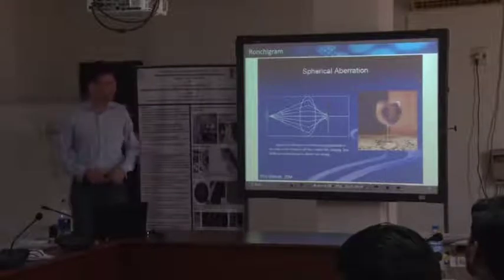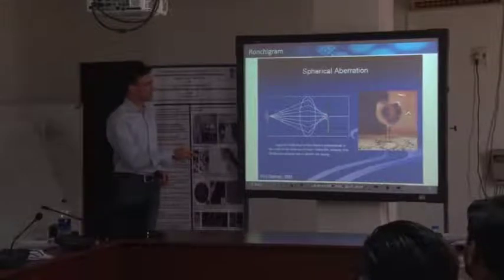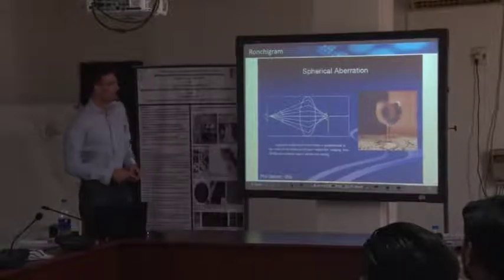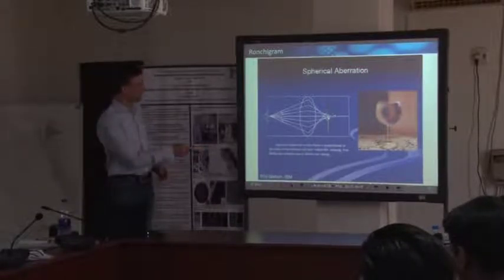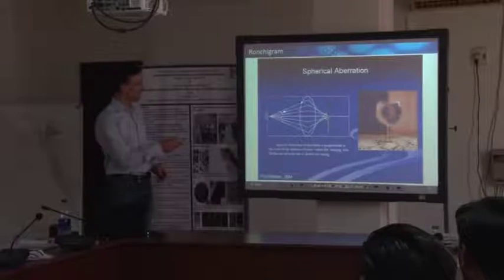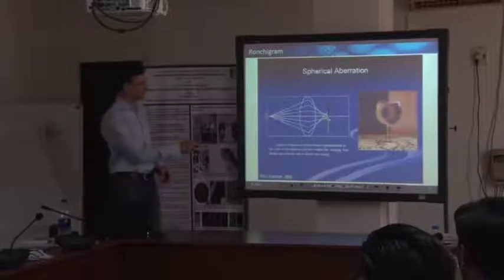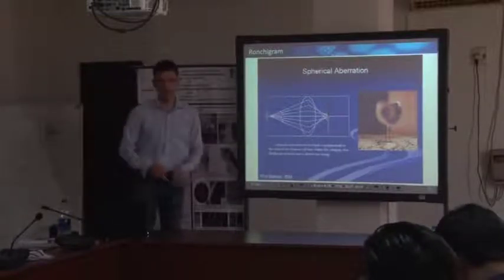And this is how this shadow image forms. In this particular case, we have a structure, just like a light optical one, and you see this bright, higher intensity here that evolves, just propagates through our lens, as you can see here. And we have a certain mirror symmetry of our image. So what you see is that the light that propagates from here ends there on the left-hand, upper side, and the dark here. So this is just an inversion that happens with such a lens.